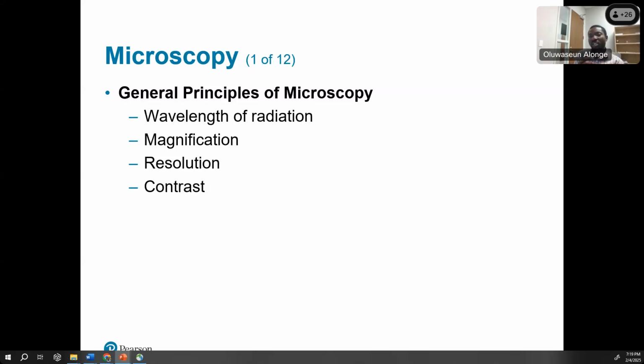And there are some stains that can be used to stain different slides, but that does not change the content of the slide. So what we look at, and that's what all of those do. So we'll be talking about that. We stain images to give contrast.